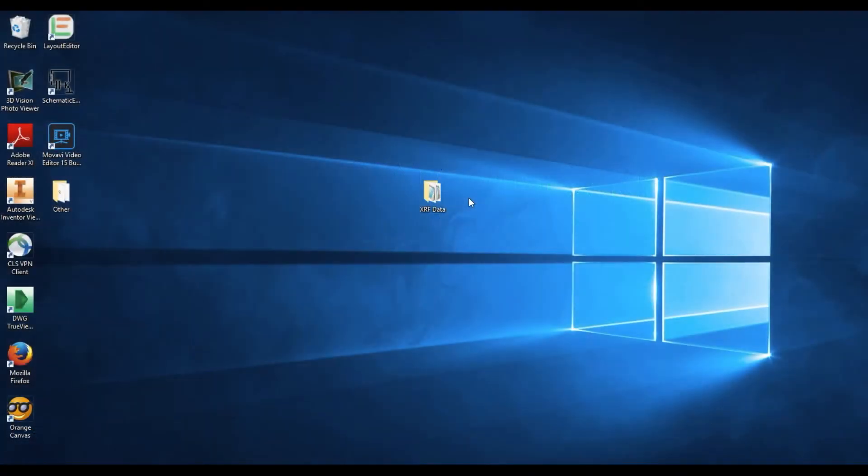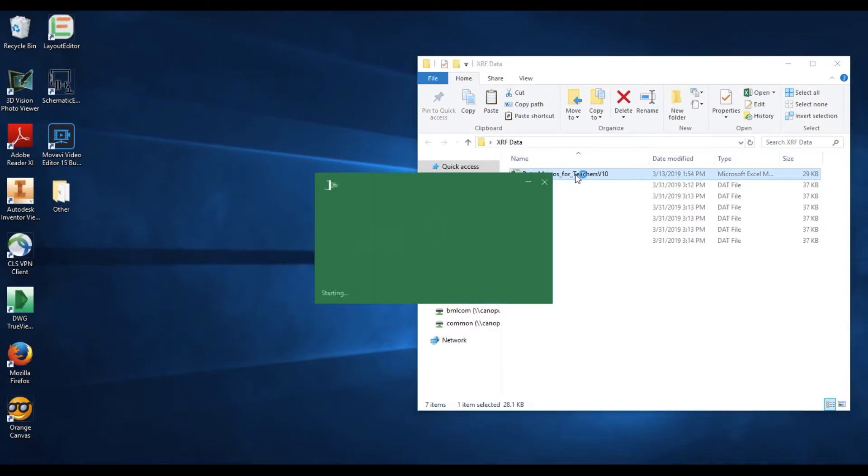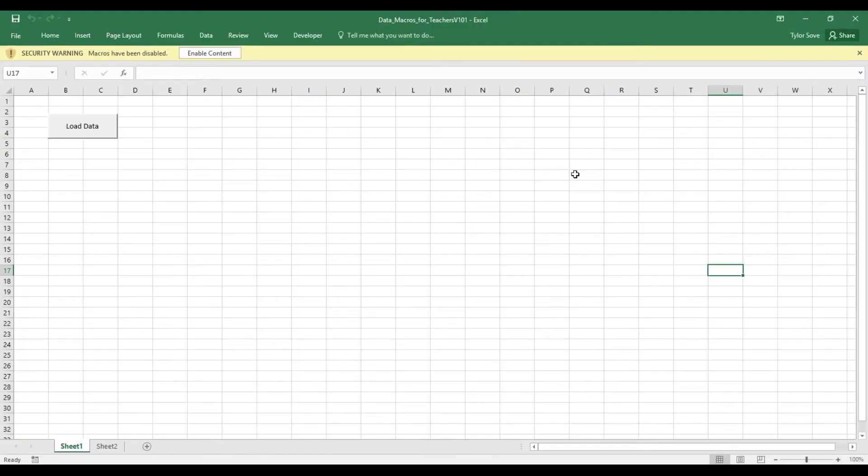To import your XRAP data, simply open up the data folder, open up that Excel file, and if this is your first time using this Excel file, you will need to enable content for this to work.